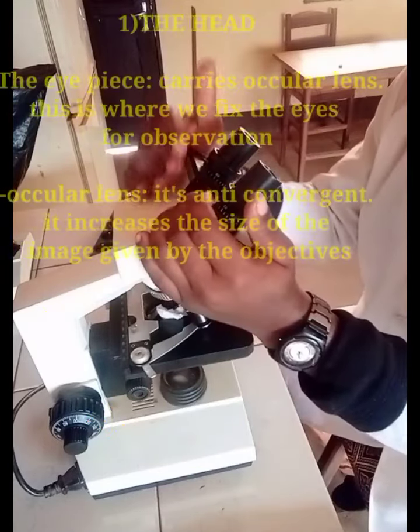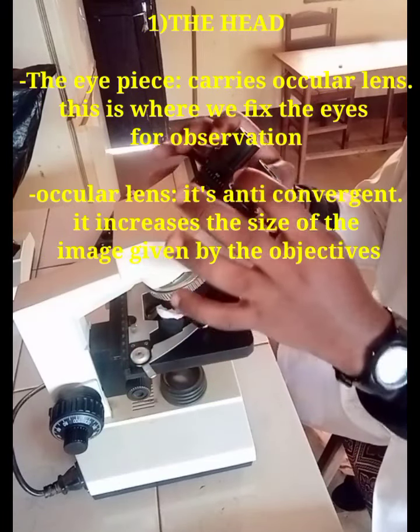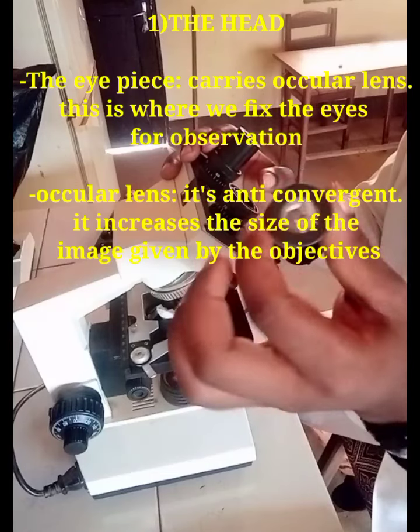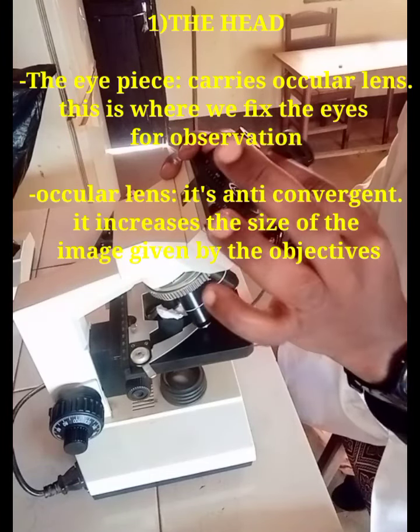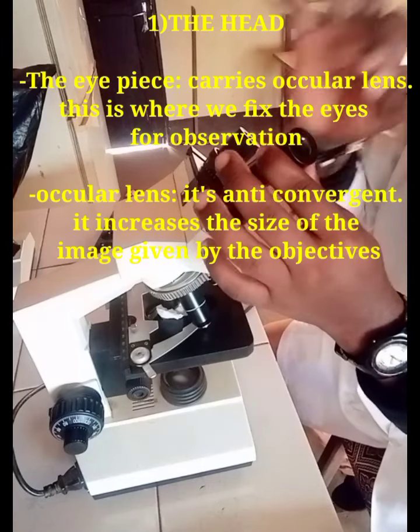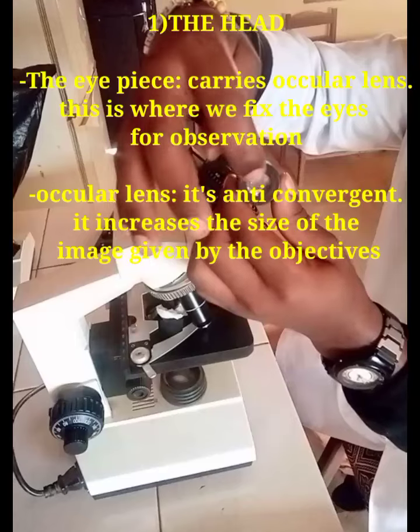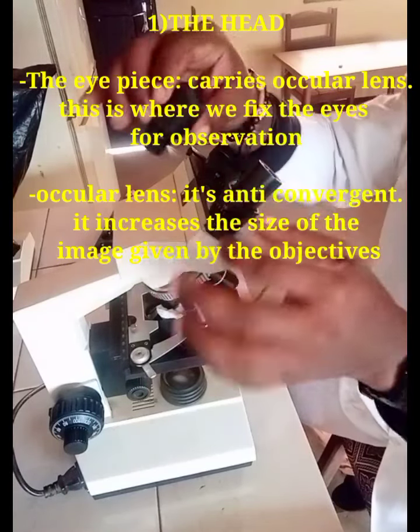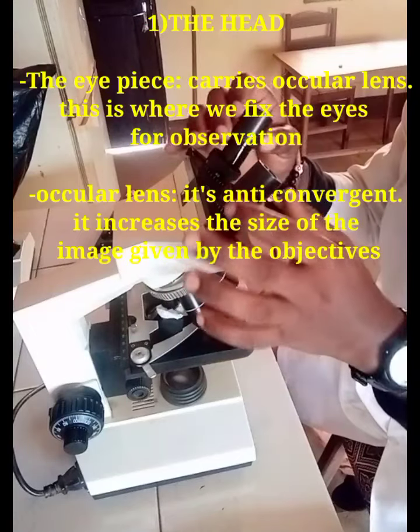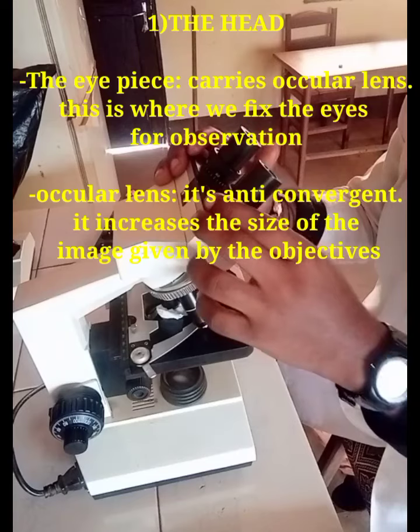Beginning from the head, on the head of the microscope we have the eyepiece. We call this the eyepiece, and this eyepiece contains an ocular lens. So we have two eyepieces with two ocular lenses. That's actually why it is called a binocular optical microscope.